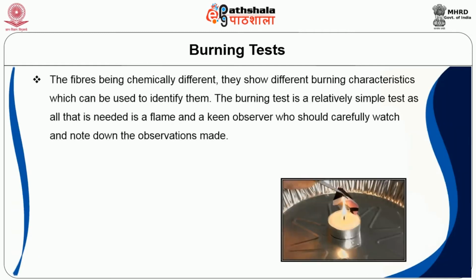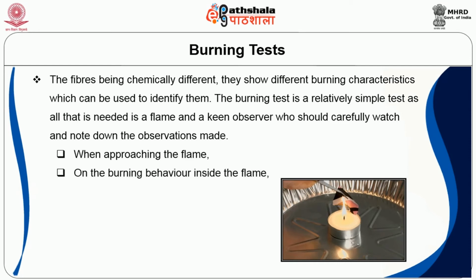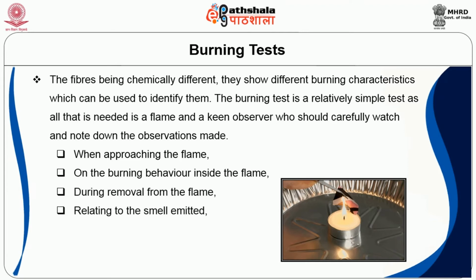In the case of burning test, the fibers being chemically different, different burning characteristics can be used to identify them. The burning test is a relatively simple test, as all that is needed is a flame. So we can make observations when approaching the flame, on the burning behavior inside the flame, during the removal of the flame, relating to smell emitted, and the residue of ash.